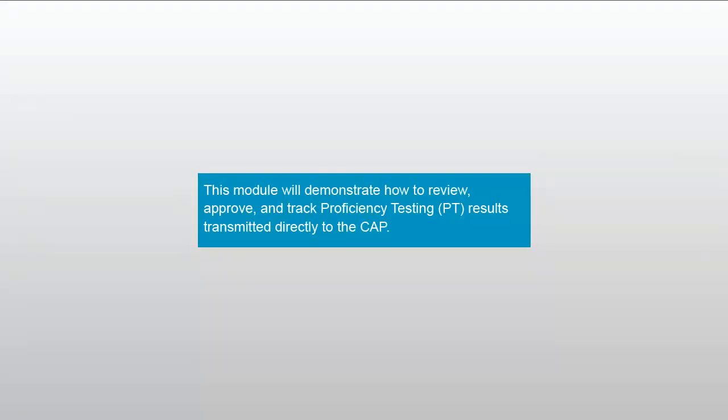This module will demonstrate how to review, approve, and track proficiency testing, or PT, results transmitted directly to the CAP.